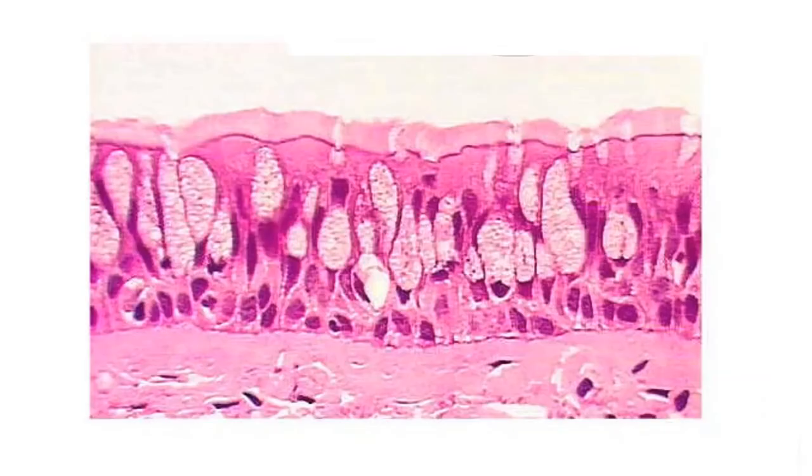All right, so I got a mess here. And again, it's going to be from here to here. I have a mess of nuclei. Looks like they're all stacked upon each other, but if we could see individual cells, they all touch the basement. So this would be pseudostratified columnar epithelium. Specifically, it's probably even ciliated pseudostratified columnar epithelium. Why that? Well, I got a train wreck of nuclei. I've got many, many goblet cells. Function, in this case, lots of secretion of mucus. Location, probably the respiratory tract.